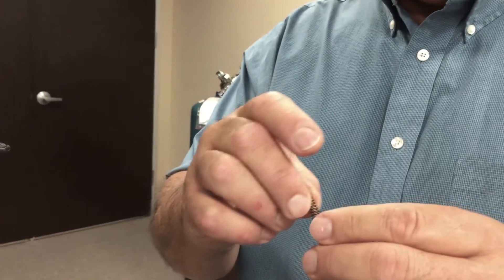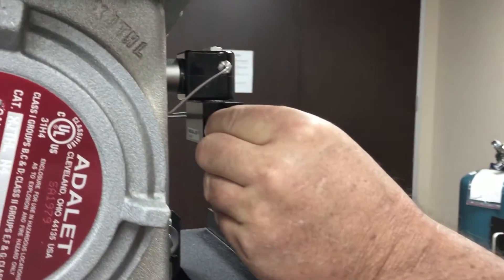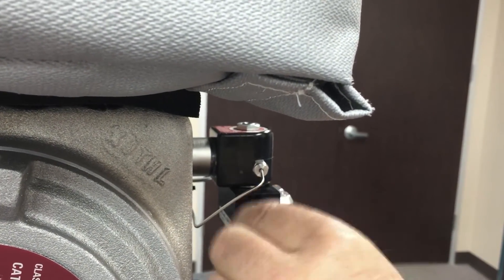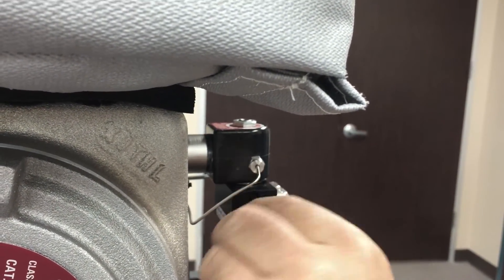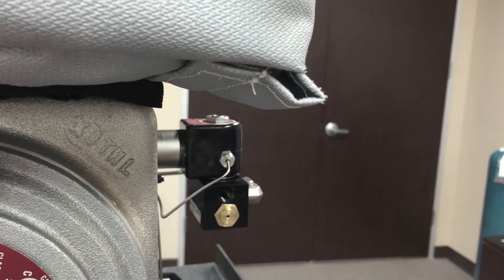We're going to take the new spring cap, place the spring in it, insert it, tighten it down. And then using the 9-16 inch wrench, we'll just snug it down.